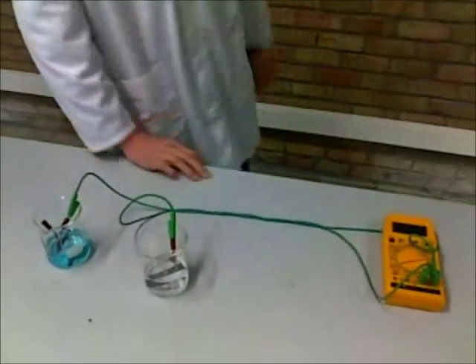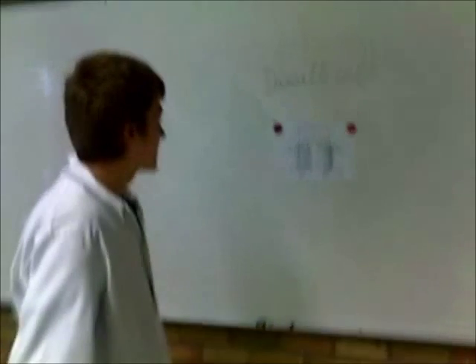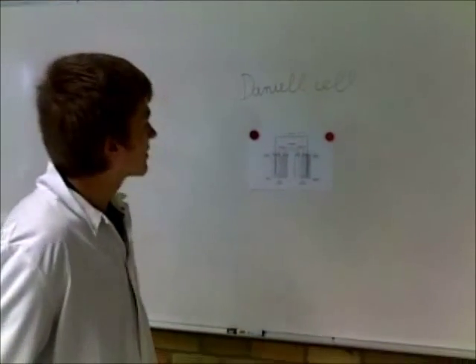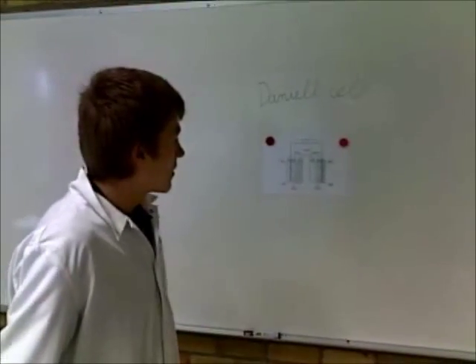And now for the tricky parts. The first part of the experiment, that's to make the salt bridge. Often that's where the failure comes along. So what should I do?